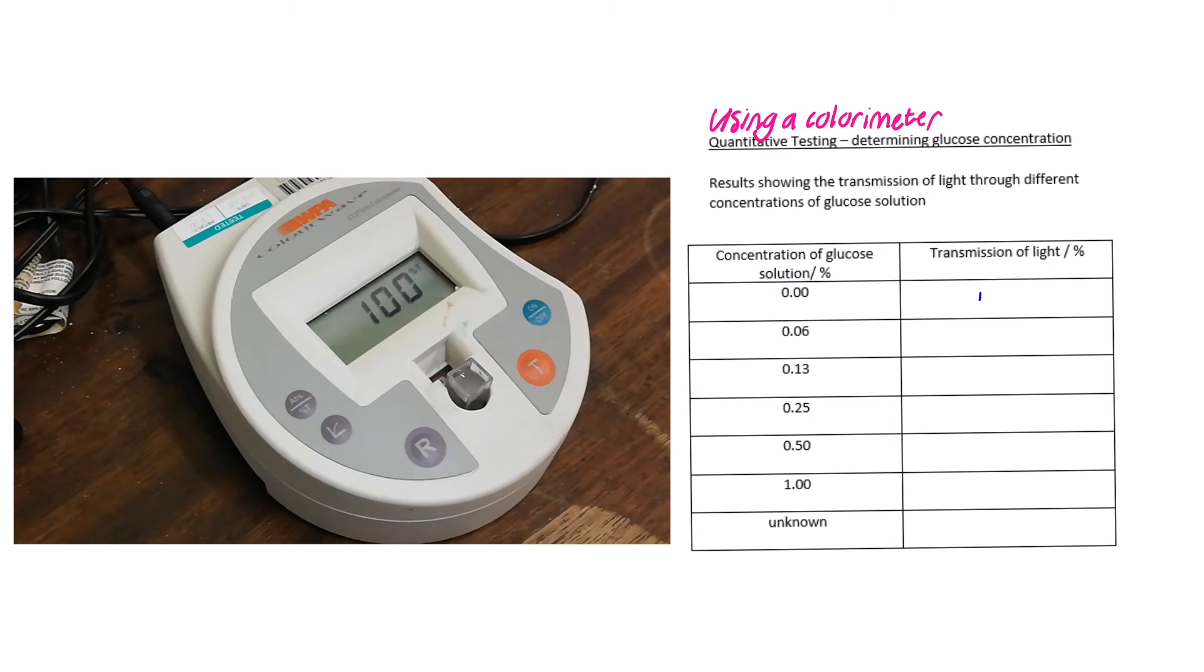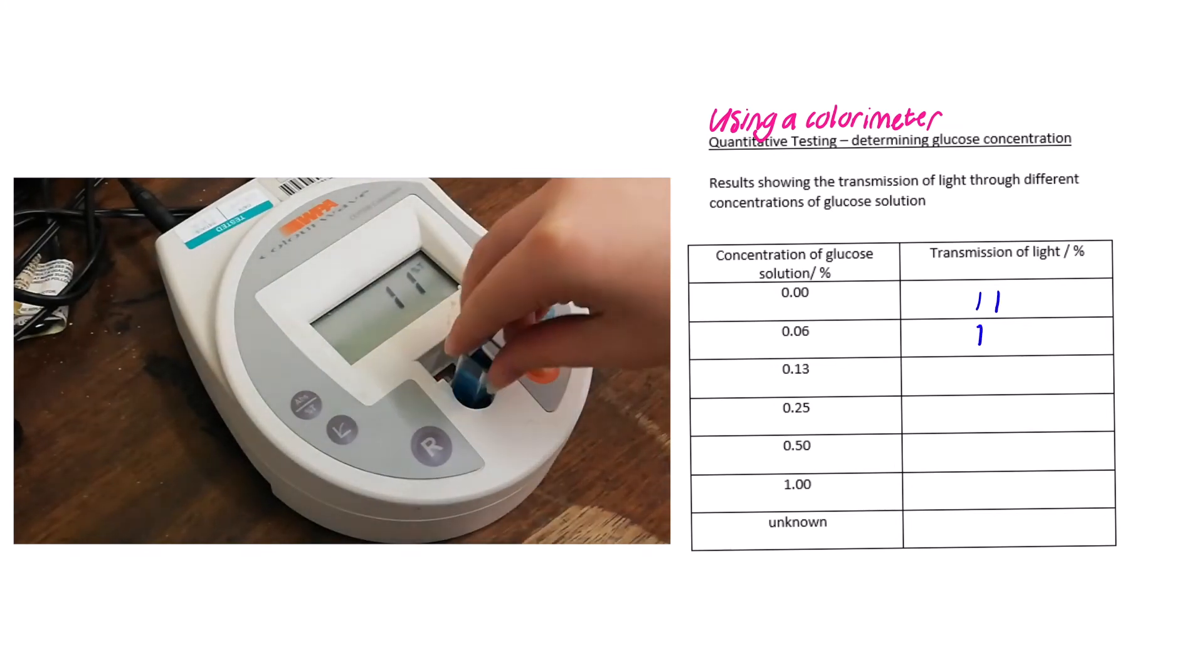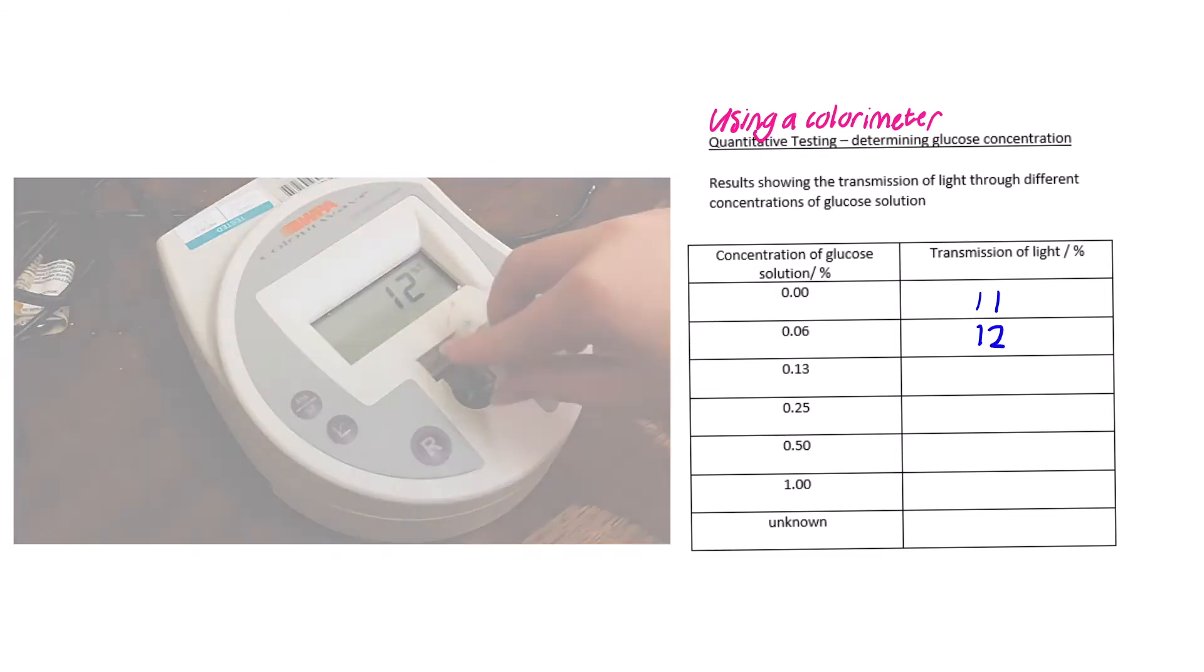Now you don't need to do that again. You now need to measure the percentage of light that passes through each concentration. So put the 0% into the colorimeter and press T, record your result. Then 0.06%, press T and record your result, and continue for all the concentrations including the unknown.